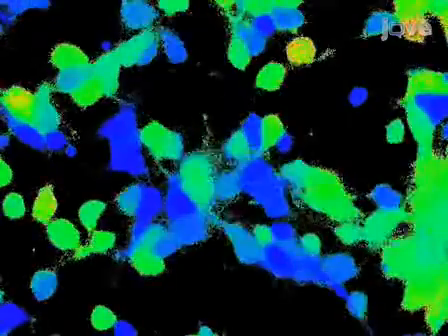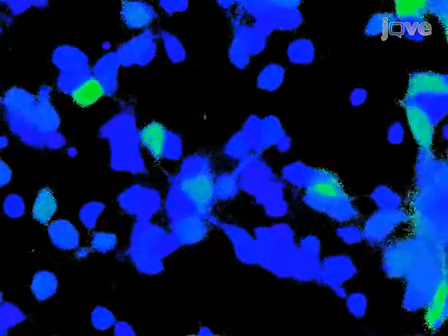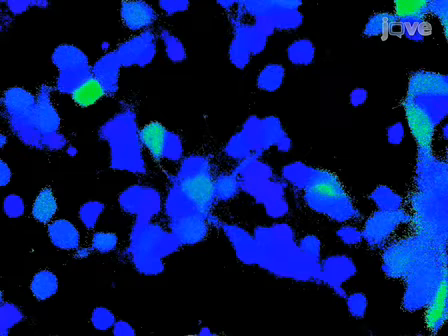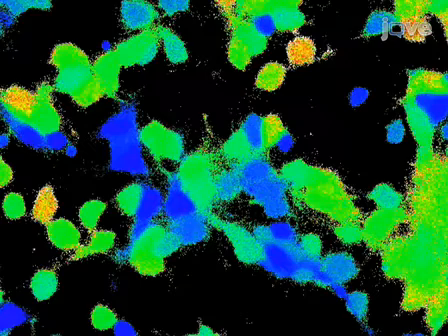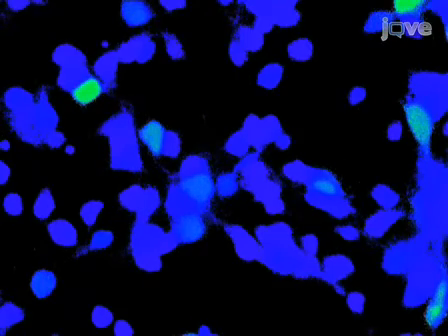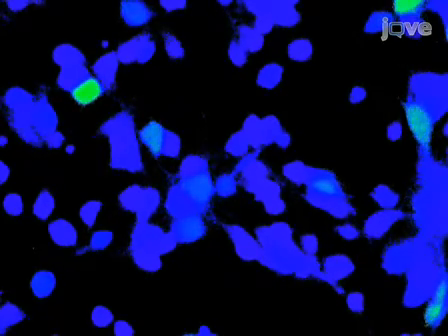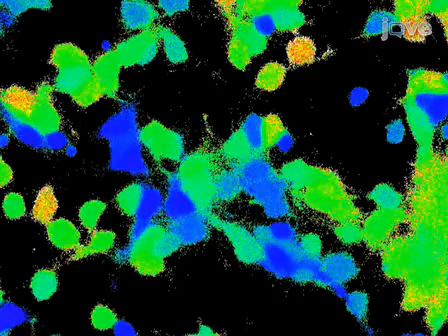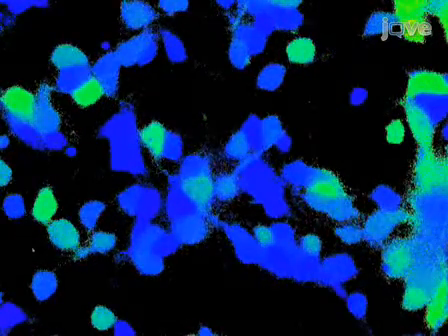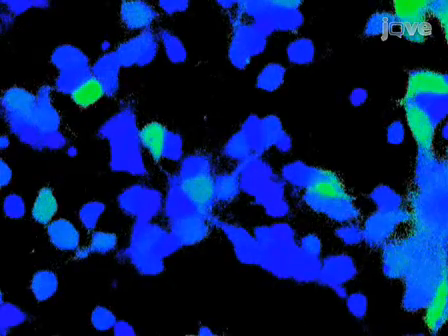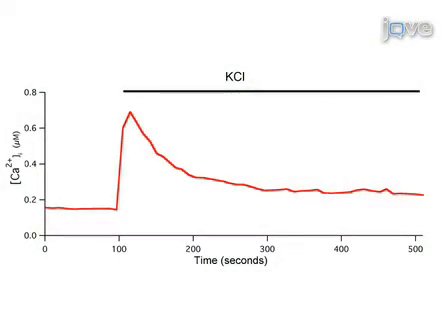This is a calcium imaging movie of Fura-2-loaded neurons stimulated with potassium chloride. The image is pseudo-colored so that low Fura-2 ratios, corresponding to low calcium concentrations, are blue, and high ratios, corresponding to high calcium concentrations, are yellow and red. Upon depolarization with potassium chloride, which opens voltage-gated calcium channels, calcium rises and the Fura-2 340 to 380 excitation ratio increases, causing the neurons to become yellow and red. Calcium is then removed from the cytoplasm, causing the cells to become blue again. These ratio values were converted to calcium concentrations using a simple equation and Igor Pro.